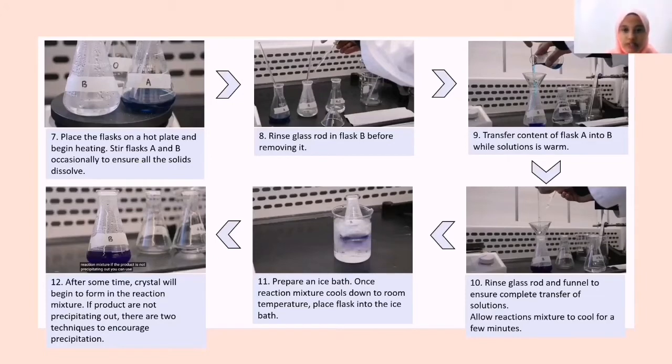Next, we transfer the content of flask A into B while the solution is still warm. Make sure to rinse the glass rod as well as the funnel to ensure the complete transfer of the solution. Then we allow the mixture to cool for a few minutes.